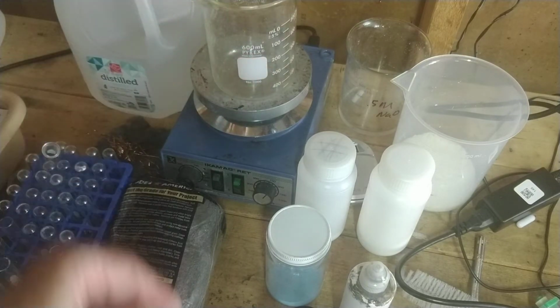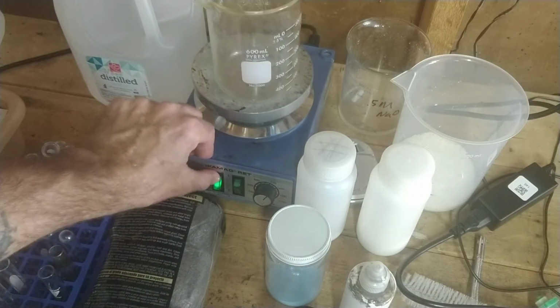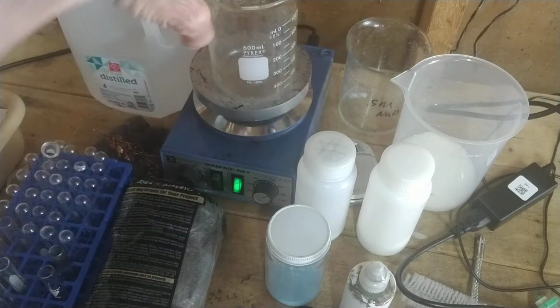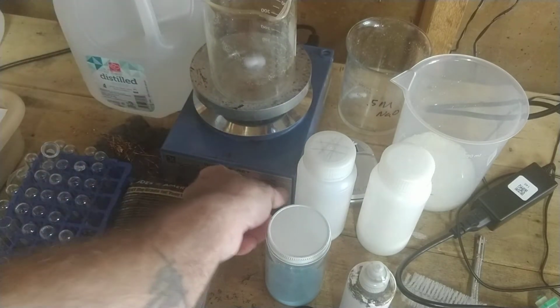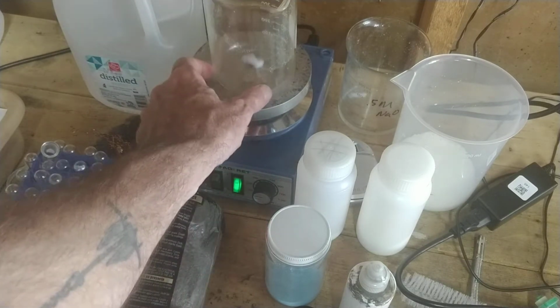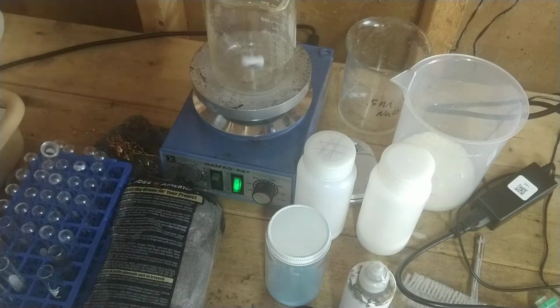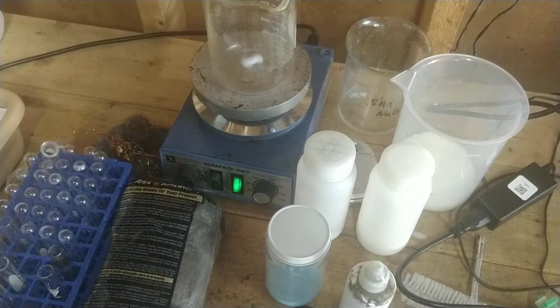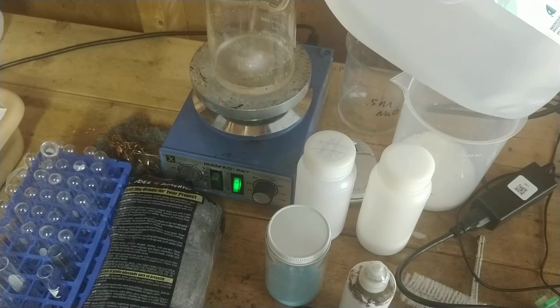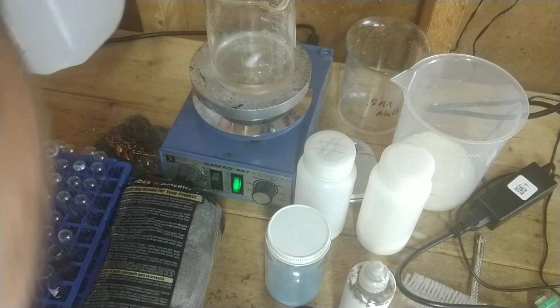I've got a beaker, and I can take this little magnetic stirrer, put it down in there, turn this mixer on, and if you look, it spins that magnet. Now that's pretty sweet. Why would we want to spin a magnet in there? So we could mix something, so we can make something dissolve. I've got some distilled water here. Put a little distilled water in there. And you see the magnet mixing the water up.